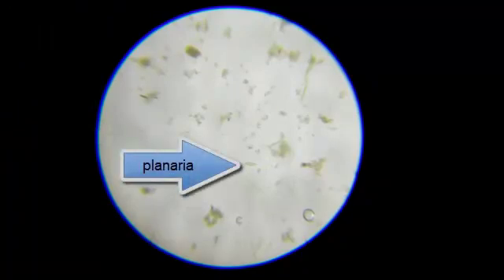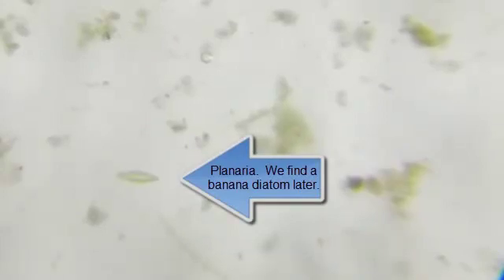Moving very, very slowly. So it could be a planarian. Looks like it. The other thing that has that shape is a diatom, although that's a little too big for a diatom. There are banana diatoms that look like a straightened out banana. But yeah, that's a planarian.